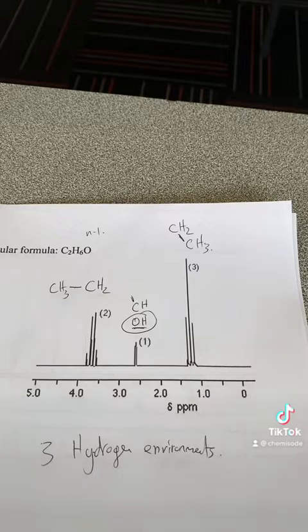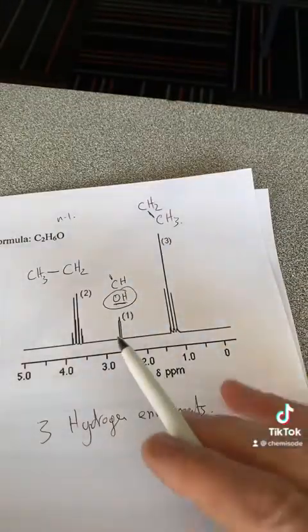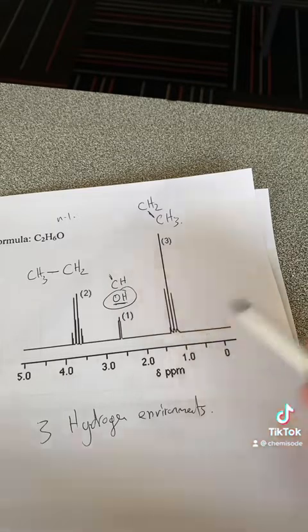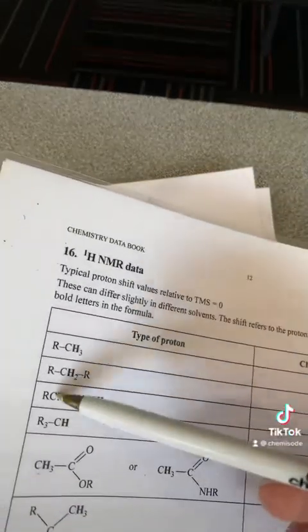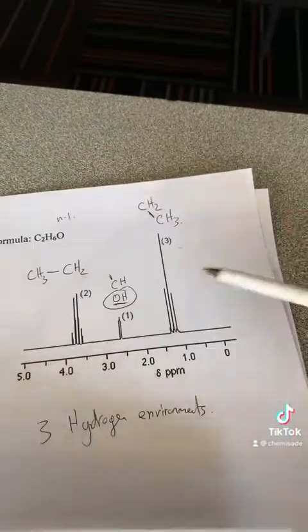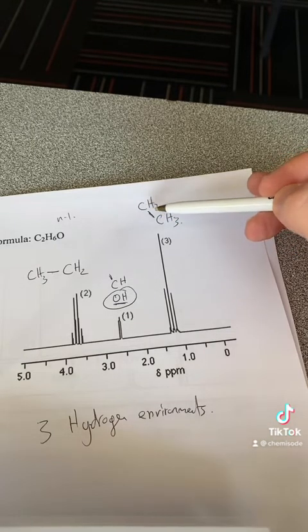The last piece of information I'm going to take from this is looking at the chemical shifts, which is about the types of environments. Now, our data booklet here has a whole bunch of types of environments. I'm going to start off with this peak here. It's really low in chemical shift. What that means is if I go to here, it's going to be a pretty boring alkyl group. It's going to be a CH bonded to something that's not that exciting at all. If that makes sense, it's going to be this CH3 bonded to simply a CH2 there.